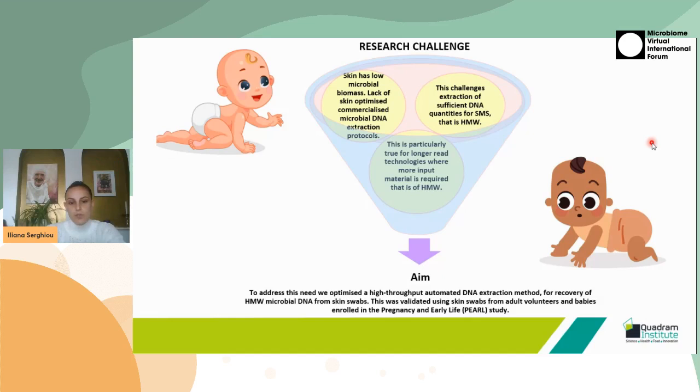So we aimed to address this need by optimizing a high-throughput automated DNA extraction method for recovery of high molecular weight microbial DNA from skin swabs. And this was validated using swabs from adult volunteers and also babies that are enrolled in the pregnancy and early life study.